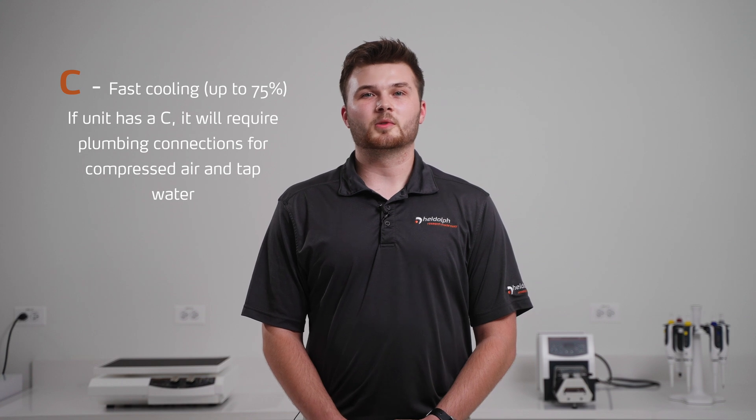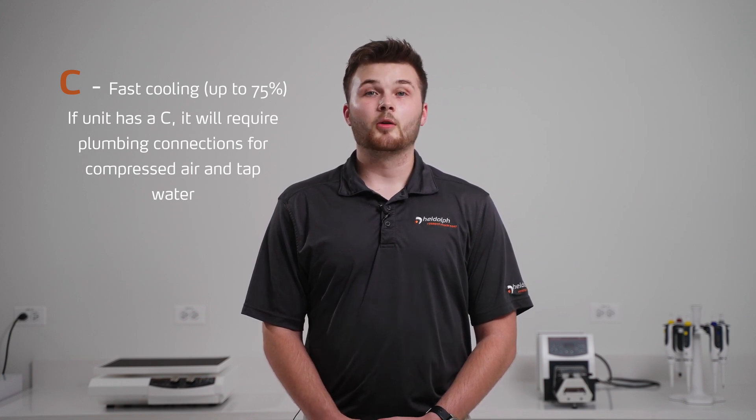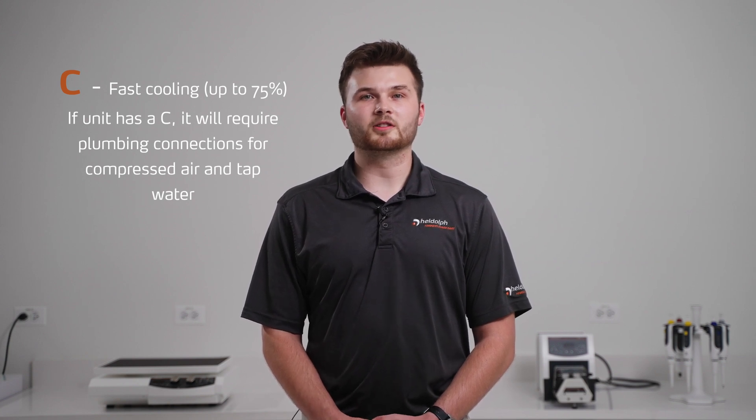The time to cool down liquids can be reduced by up to 75 percent through the use of cooling coils. While the cooling coils efficiently remove heat from the liquid, compressed air prevents it from boiling over.